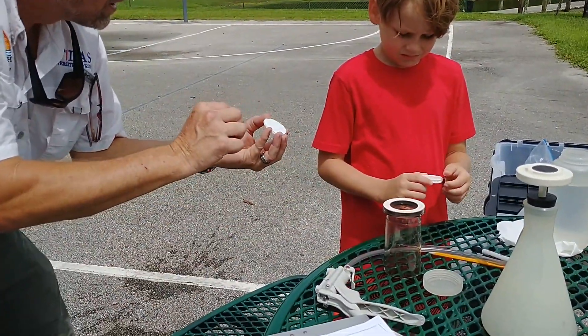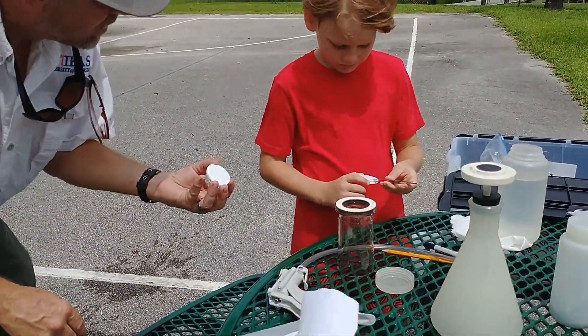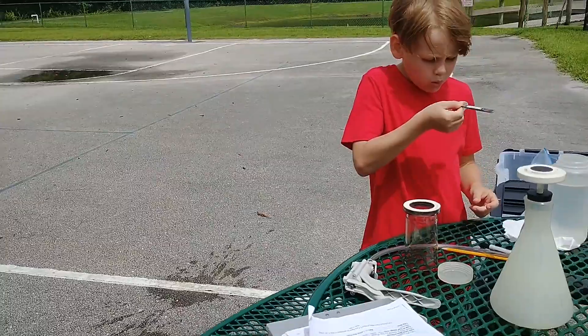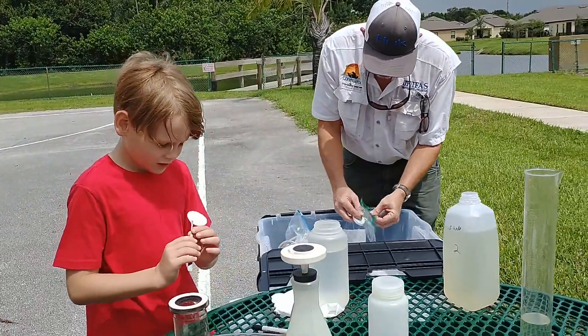Now take your forceps. See, when you hold it — see how it popped up a little bit? Same thing happened to yours. Grab one of them, then hand me the rest so we don't lose them. Blow on it to make sure there's just one. Now what side goes up — the smooth side or the rough side? The rough side. There you go. Good memory.